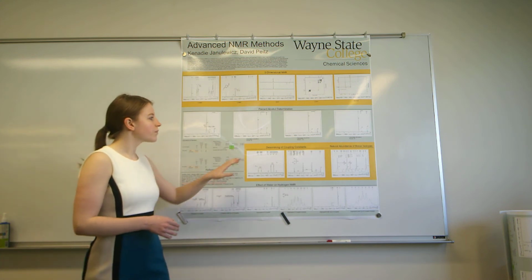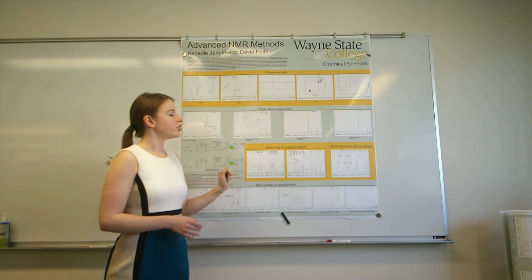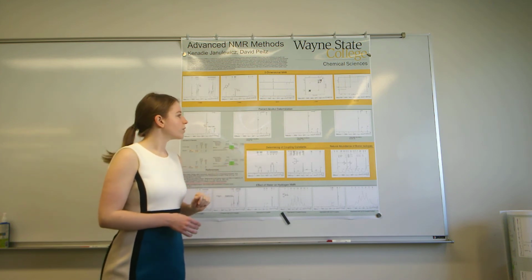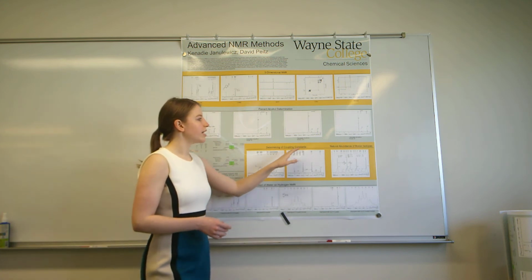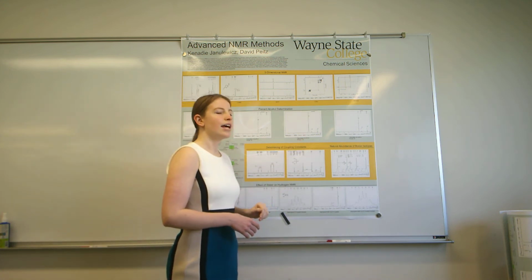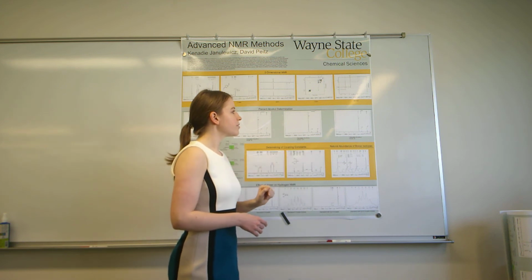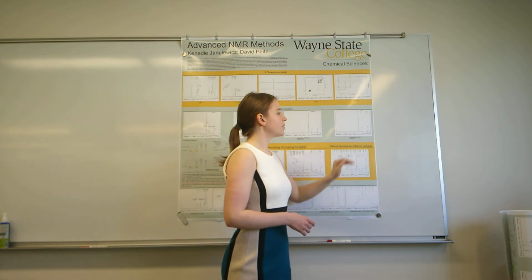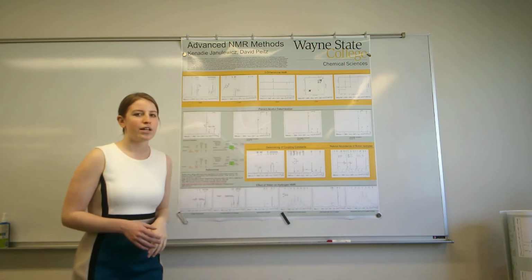Here are 3. For Glenlivet, we were able to calculate 40.2 with our CH2 peak and 40.4 with our CH3 peak, while the label read 40. For Chardonnay, we calculated 13.7 and 17.5, while the actual was 13.5. And then for vodka, we calculated 40.4 for both the CH2 and the CH3 peak, while the actual is 40.